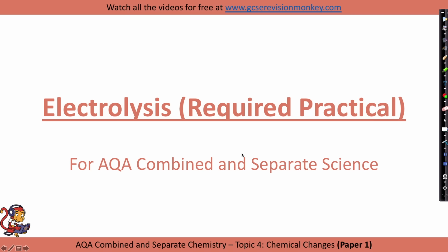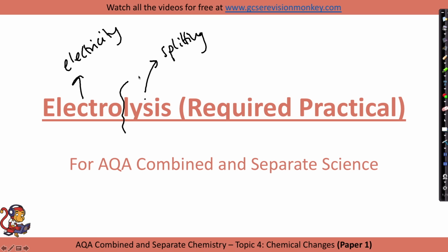Electrolysis required practical. I think it helps by reminding what electrolysis is: it's lysis, which is splitting using electricity. So practical people find quite difficult. Let's think about what we might want to split up. For example, if we've got a rock with a metal in it, for example, lead bromide, we might want to split that rock up so that we can get our lead out to make various things with it.